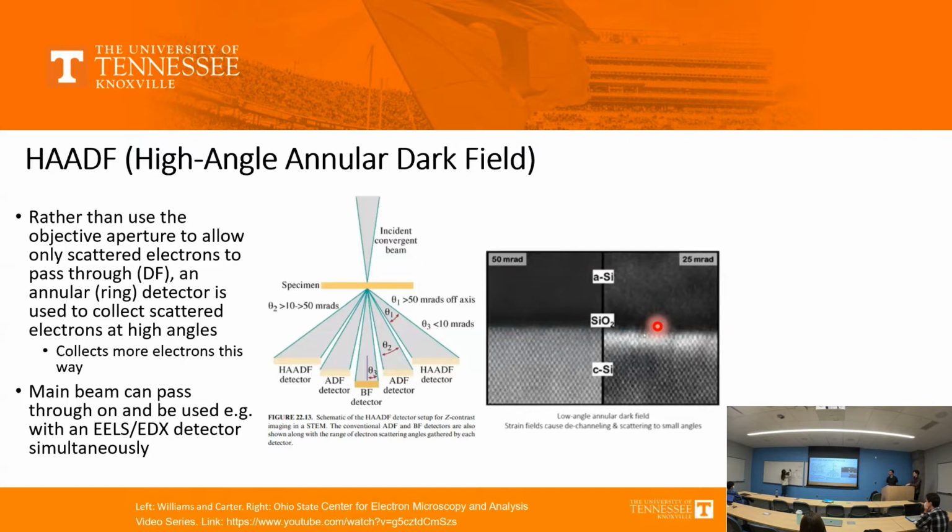You're just trying to know if it's silicon, oxygen, or aluminum, and we are putting two detectors. One is a low angle detector, and one is a high angle, right? The electron is passing and interacting with the nucleus. It can be a silicon nucleus, oxygen nucleus, or whatever is in the material: silicon, oxygen, nitrogen. I won't go below oxygen generally. Some of the electrons scatter here, and some scatter at a higher angle.